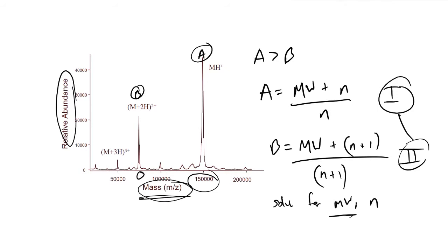In addition to that, there are other kinds of mass spectroscopy techniques in which we use quadrupoles to essentially obliterate these molecules and form radicals that will fling out and hit a detector. We'll get all these different mass to charge ratios based on homolytic bond breakage, where a pair of electrons will break evenly, so one electron will go to each part of the fragment. With that information, based on that unique spectra of mass to charge ratios, we can identify compounds.